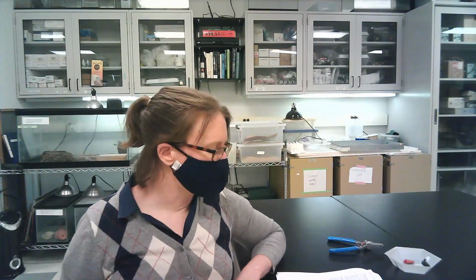One thing I will say also for this lab is this is a lab where it's going to be really useful to spend some time and thought with the lab handout before you get to lab. So absolutely make sure that you have a good sense of what your predictions are across the different experiments. You're going to want to figure out someone to specialize on getting all of the wiring set up, and then you'll be able to have smooth sailing once you get to lab.